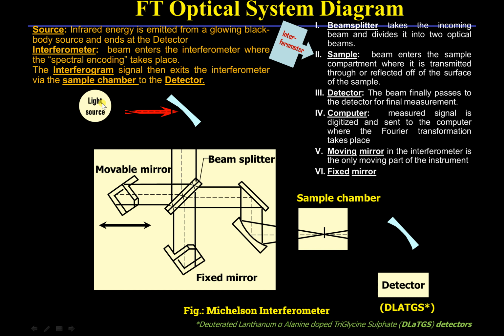So starting from the light source, it falls on the mirror, from which it is now directed to the interferometer. This entire thing is an interferometer.